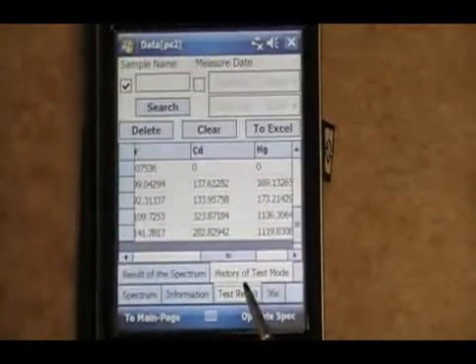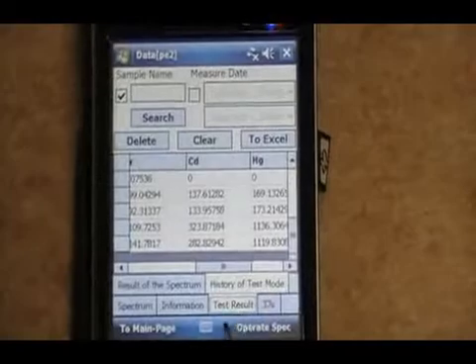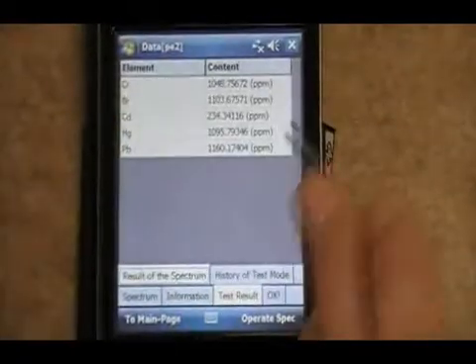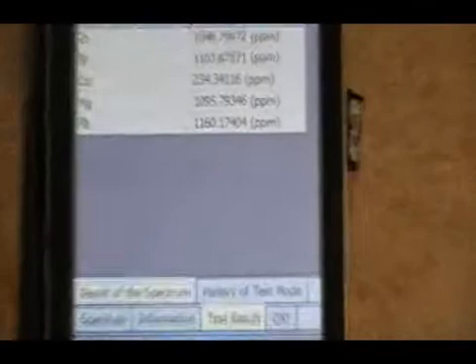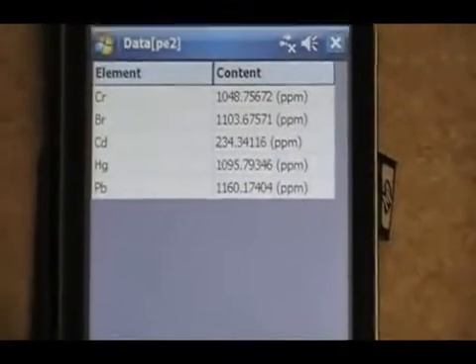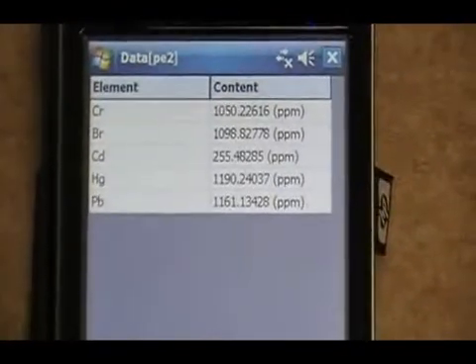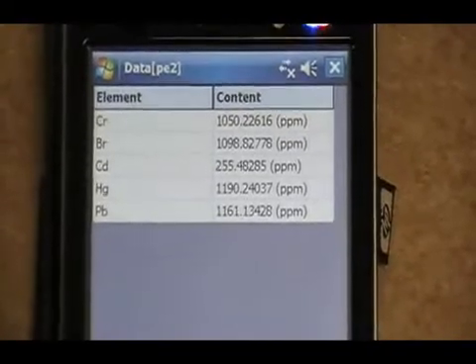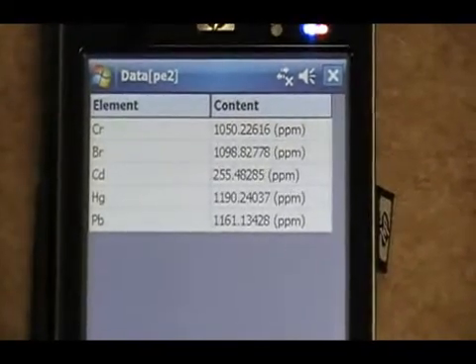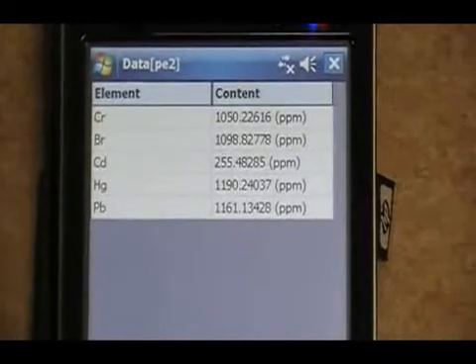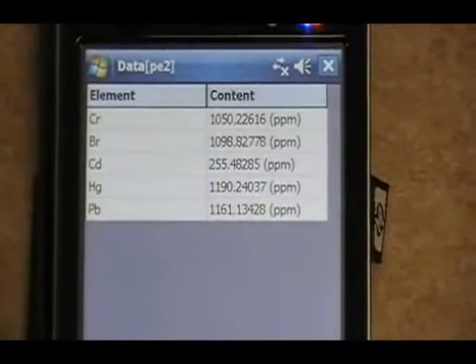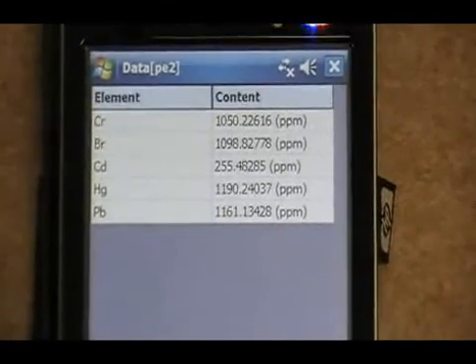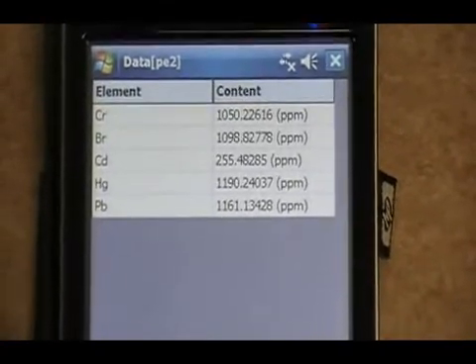The result of the spectrum is what we're currently running. Our chrome is approximately 1,000. Our lead is approximately 1,200. Our cadmium is 300. Our bromine is 1,100. And our mercury is 1,100.